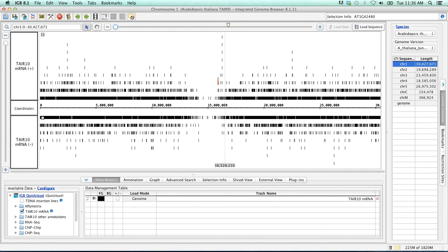Okay, so now that we've had a brief refresher on navigating through IGBE, I want to provide us with an example of alternative splicing and then we will investigate it. In our example, let's pretend we just finished a large RNA-seq experiment where we were interested in the differences in alternative splicing between a control group and an experimental group that was cold treated. Let's load up this data and take a look.